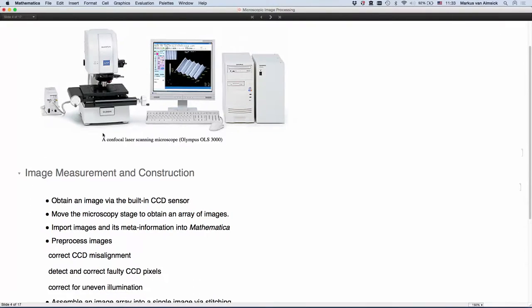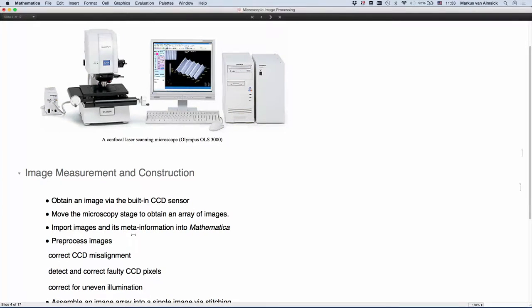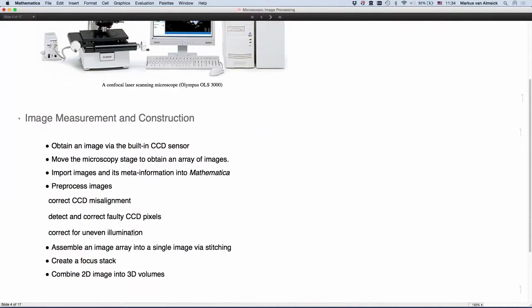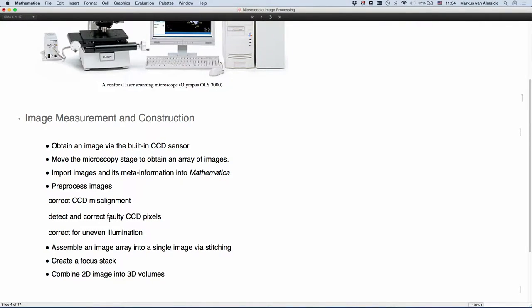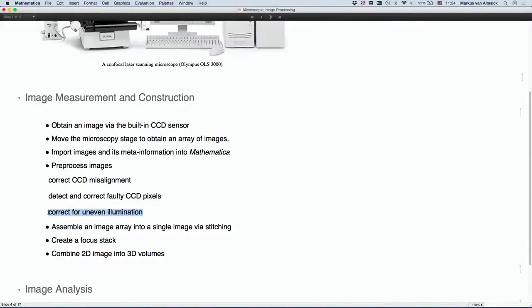Then we'll talk a little bit about how to obtain images in Mathematica, how to import them, and more importantly, how to get the meta information. And then I'll talk about what you usually do when you obtain images. You have to do some pre-processing step. You have to correct for all the shortcomings of the microscope like CCD misalignment, correct faulty pixels in the CCD, or correct for uneven illumination. Due to time reasons, I just focus on the latter one.